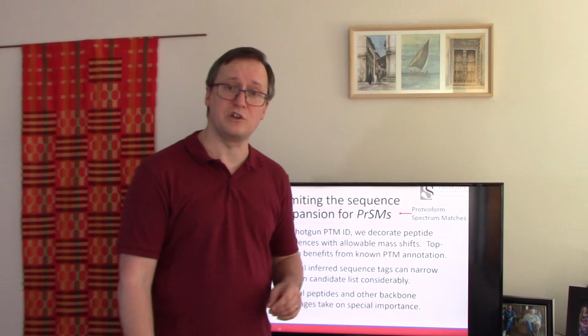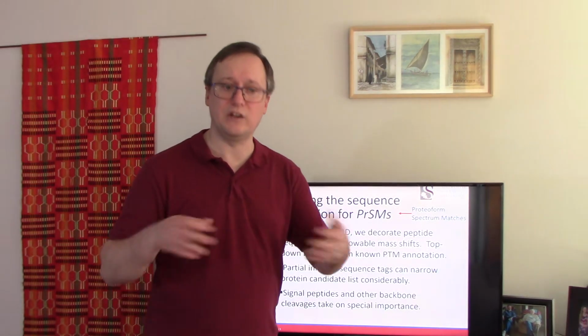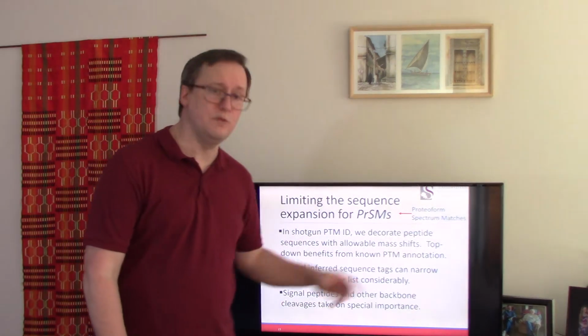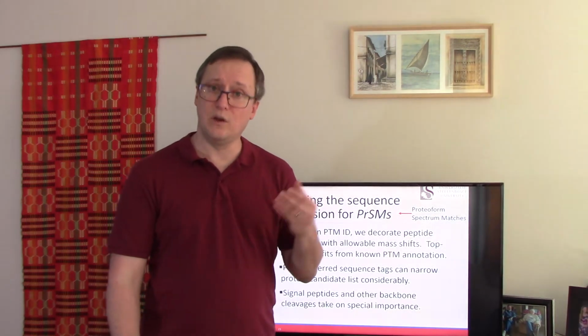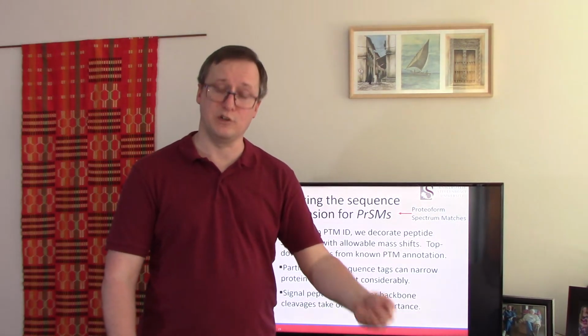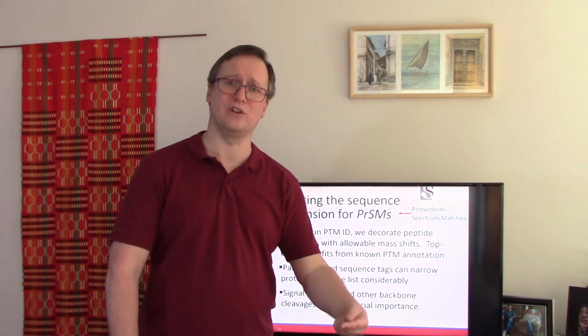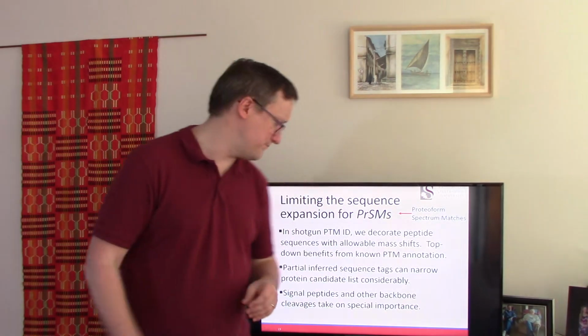It might be that you're searching against a UniProt database that you've downloaded in something other than FASTA format. In that case, known PTMs may be available along with the sequence data. When we get into top-down search for PTMs, we very frequently benefit from extensive annotation of known PTMs as a basis for our understanding the spectra.